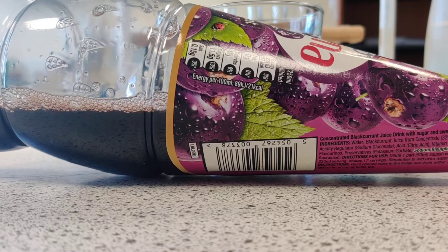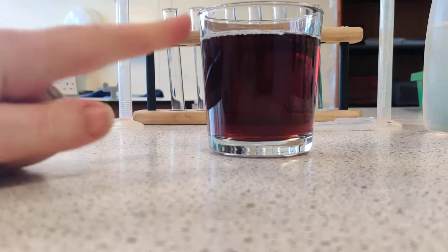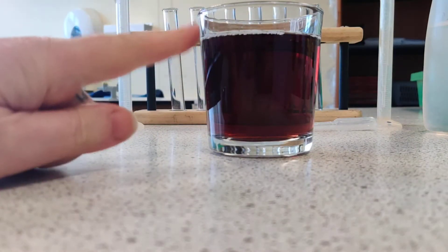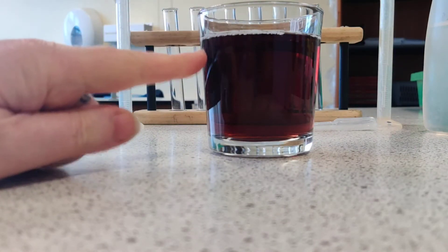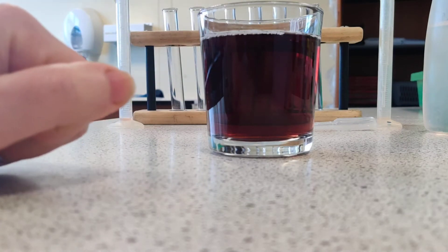Hello and welcome to the BTEC Applied Science Taster Lesson for Year 11 students at Ryburn Valley High School. This is a bottle of a well-known blackcurrant juice drink and this is Mr Lord's drink. Our challenge is to use colourimetry to work out the exact concentration of blackcurrant juice in Mr Lord's drink, so we can keep him happy and make sure we get the concentration correct.